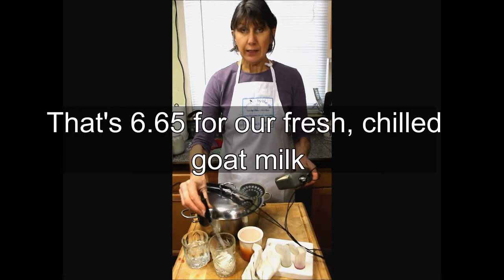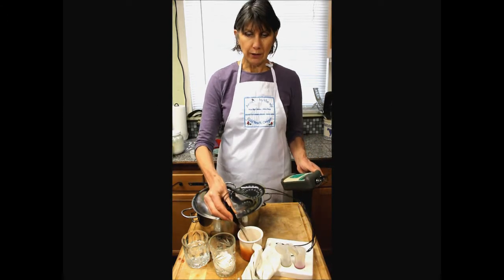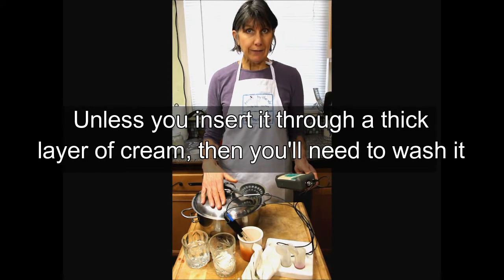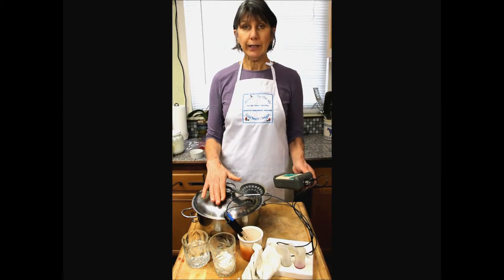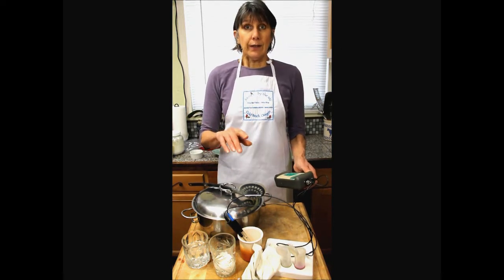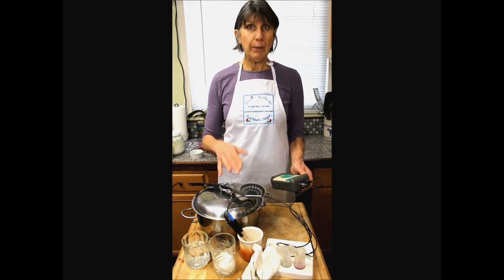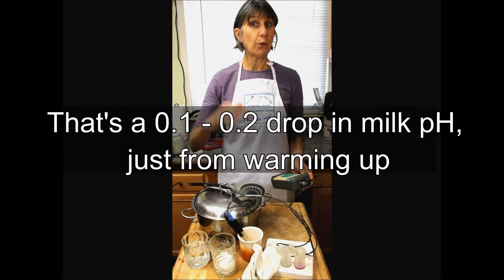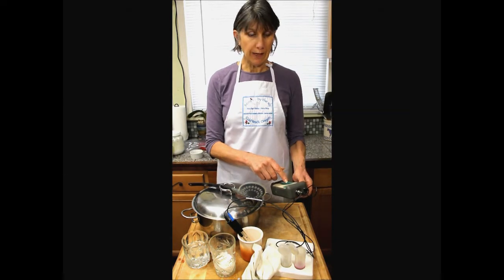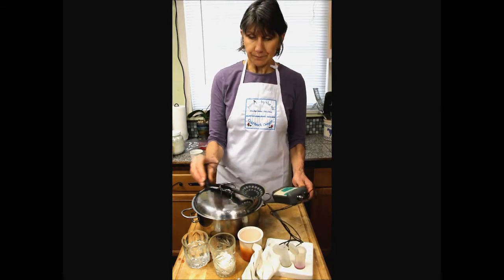Now I'm going to dip it in a warmed up milk sample. And I don't have to rinse the electrode to go back and forth between milk. So this milk has been warmed up to the ripening temperature of about 85-88 degrees. Normally, no matter whether it's cow, goat, sheep, or water buffalo, you're going to see about a 0.1 to 0.15 drop in the pH. So it's going to look like it's more acidic the warmer the milk gets. Here we have 6.55, so just about a 0.1 drop.